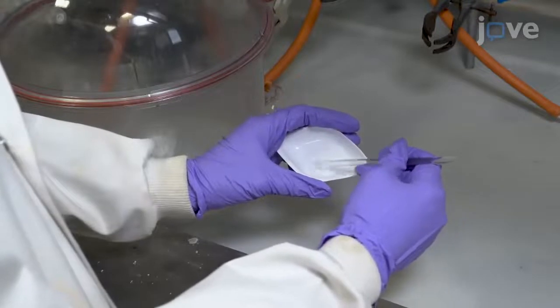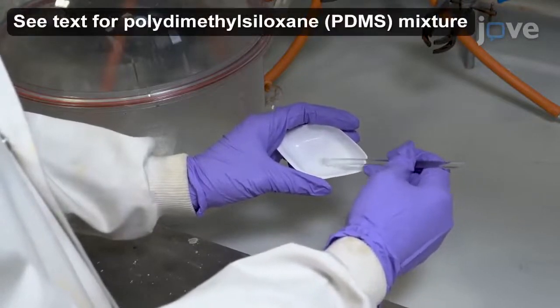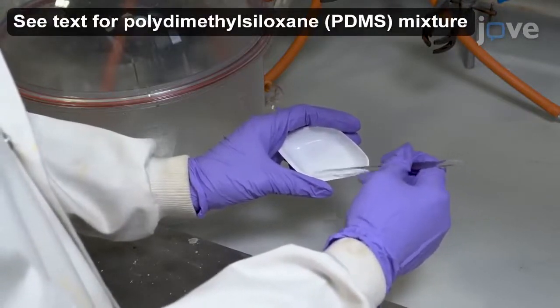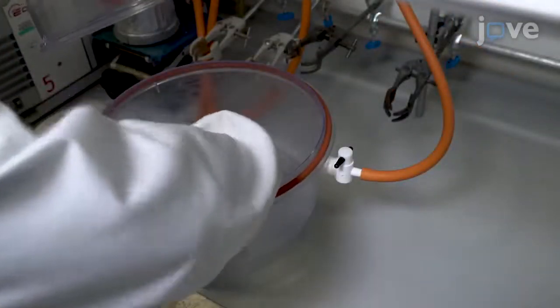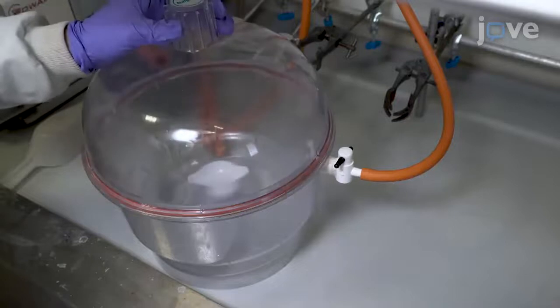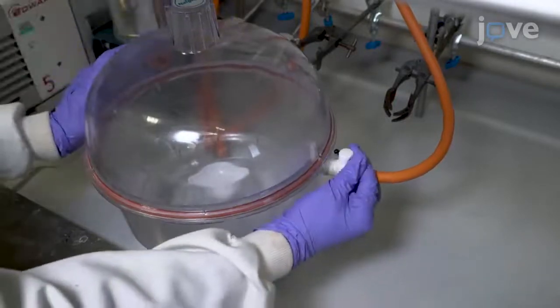To begin the procedure, thoroughly mix the components of the PDMS pre-polymer in a weighing boat. Degas the mixture in a vacuum desiccator for 20 minutes or until all gas bubbles have disappeared.